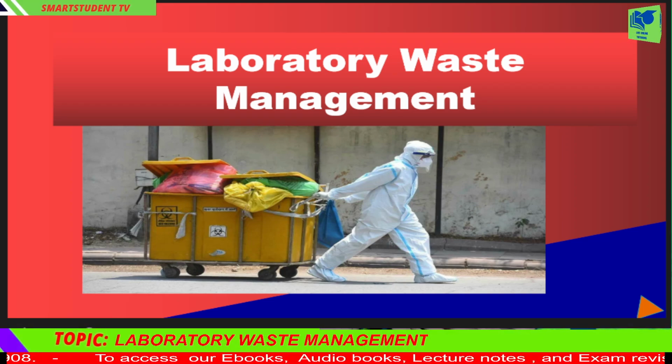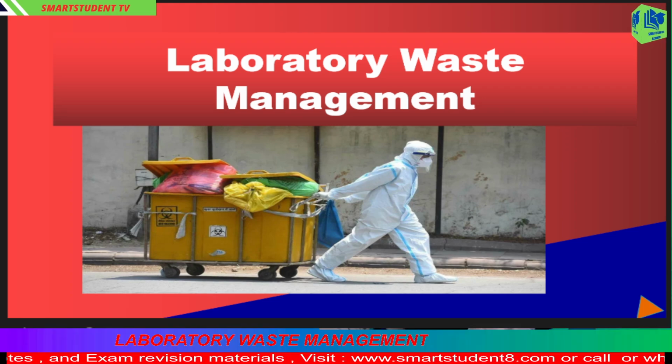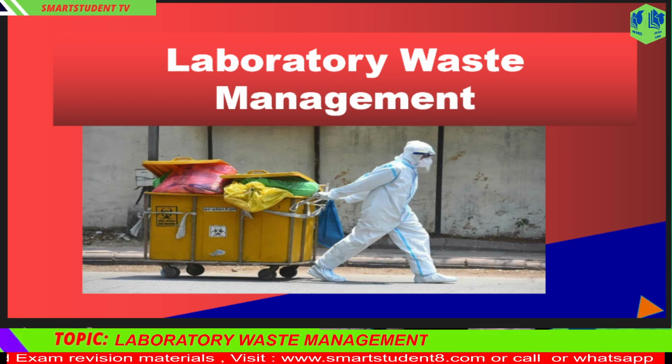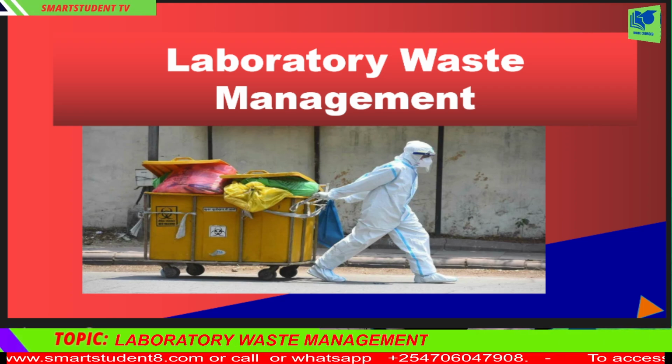In today's tutorial, we dive into another very crucial topic: laboratory waste management. Laboratories are the heart of scientific discovery, medical diagnostics, and industrial innovation. However, alongside the vital work performed in these facilities comes an often overlooked byproduct: laboratory waste. Laboratory waste refers to any unwanted or discarded material generated from laboratory activities, including research, diagnostics, testing, and production. This waste can range from harmless general waste to highly hazardous chemical, biological, or radioactive materials.